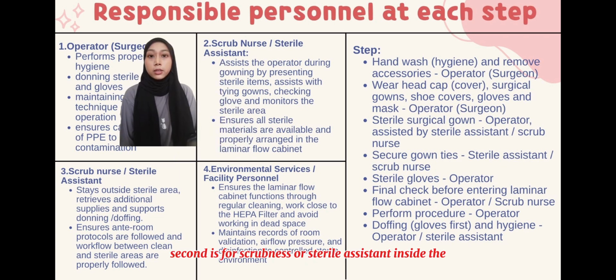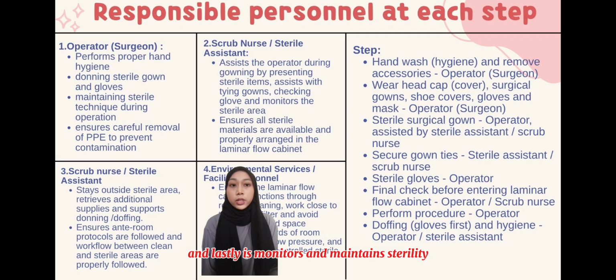Second is the scrub nurse or sterile assistant inside the sterile area. First is assist the surgeon with gowning and gloving. Prepare and arrange sterile material in the laminar flow cabinet. And lastly is monitor and maintain sterility in the work area.